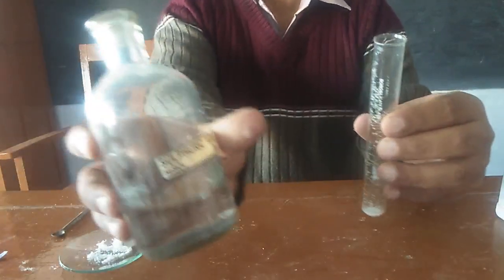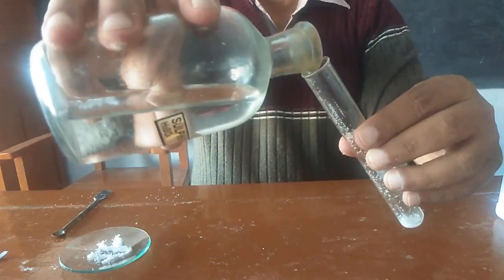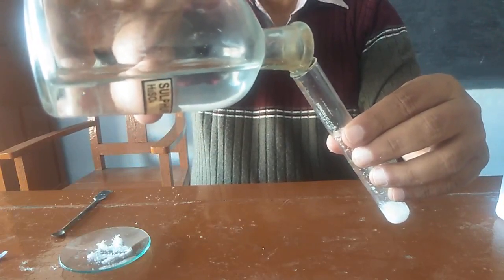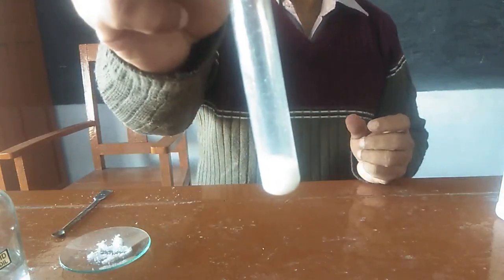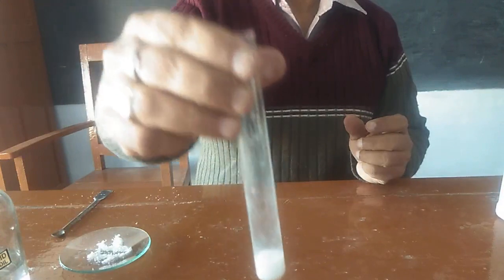We will take some salt in a test tube and add dilute H2SO4 to this very slowly. As soon as we add dilute H2SO4, the salt will get decomposed and the solution will give a smell of vinegar.